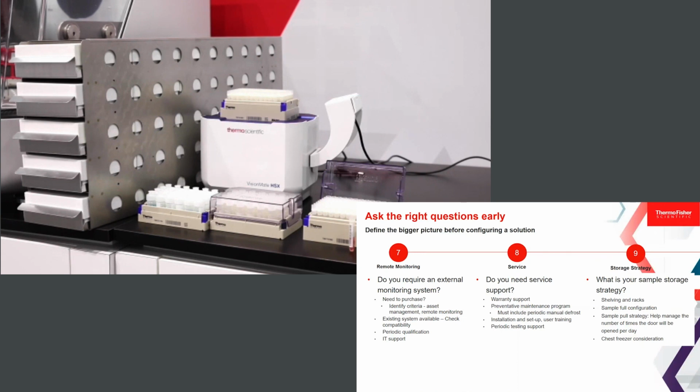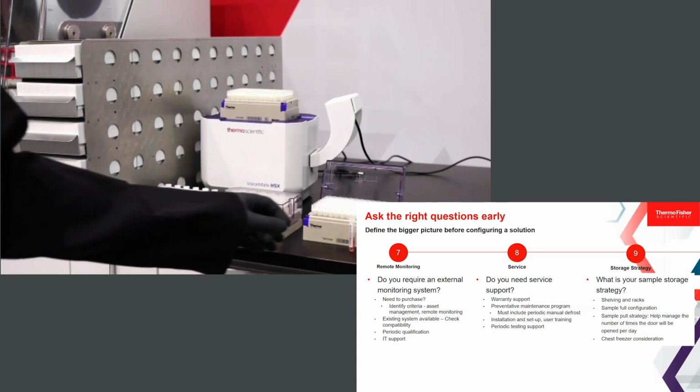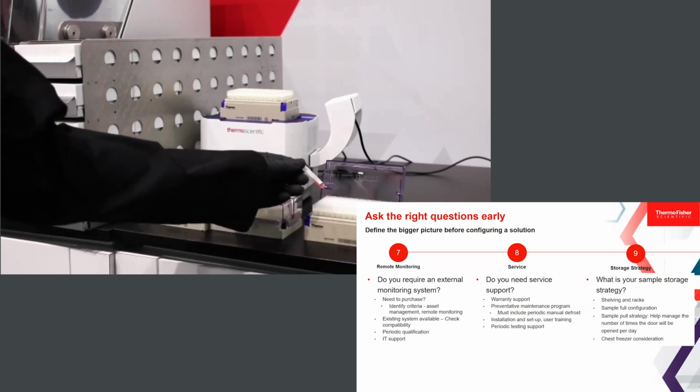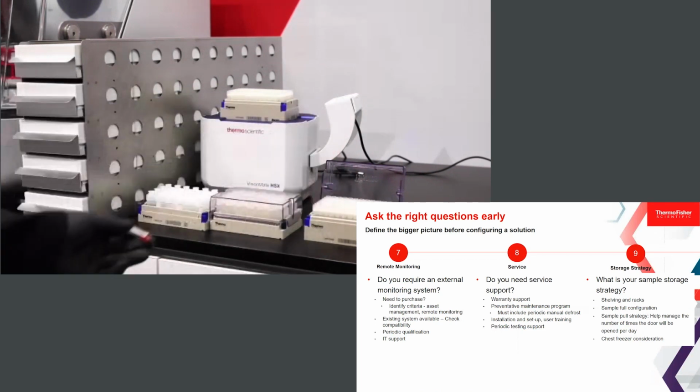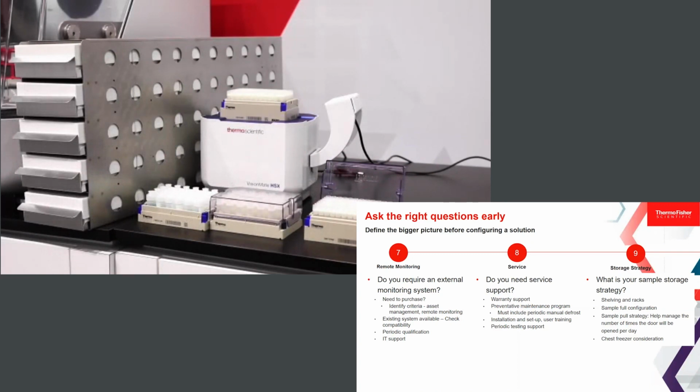You can find it right down to that sample tube in the box, right in the rack, in the freezer, on the right shelf. We can actually help you with, thank you, Danny, to show us the 2D barcoded solutions to help you really look at that full workflow from accessioning to sample storage, and then later on when you're ready to find it for that easy retrieval.